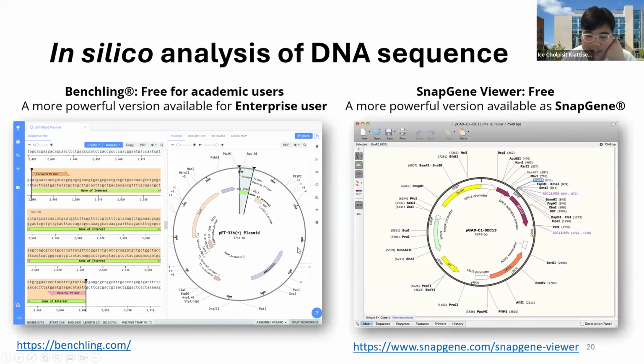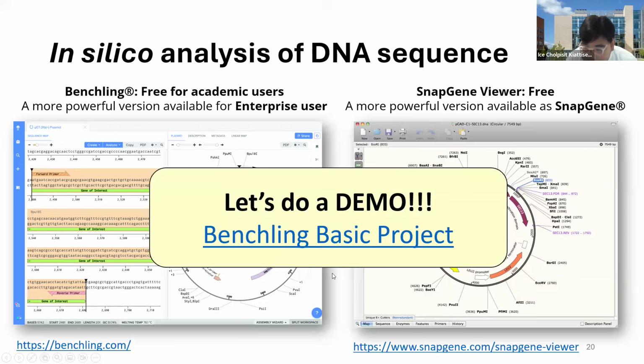All right. So again, these are the links to access the software. I'm not going to focus too much on Snapgene Viewer. There is probably some information out there that can help you navigate if you prefer these tools, or there are some other tools like ApE, a plasmid editor, Geneious, or others out there. But again, we've been using Benchling a lot, and it's free for academic users. So we're going to focus on this one, and after this, we're going to do some demo.